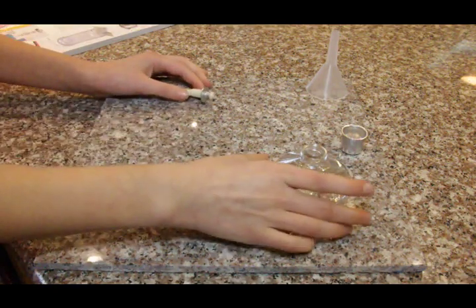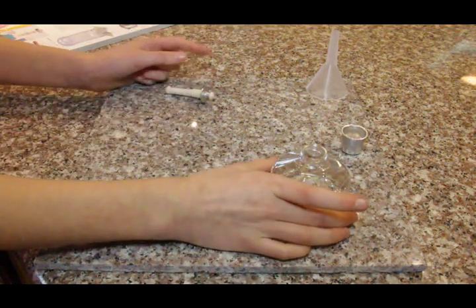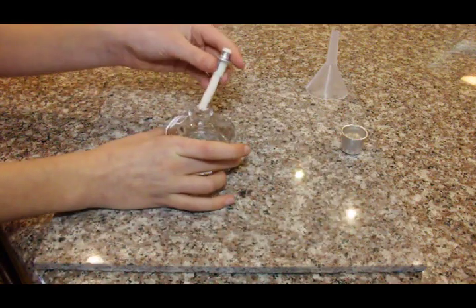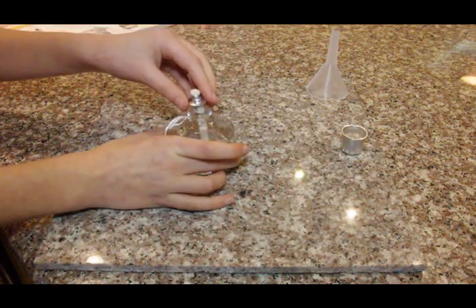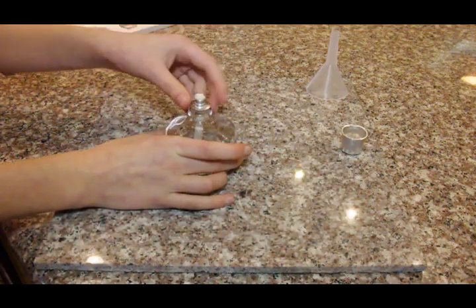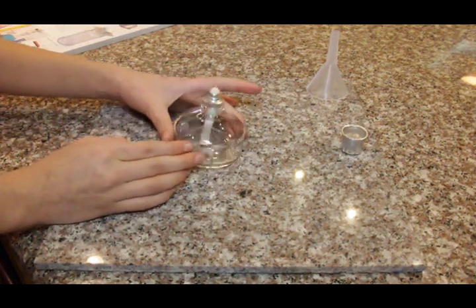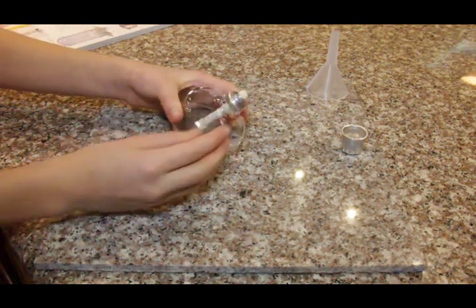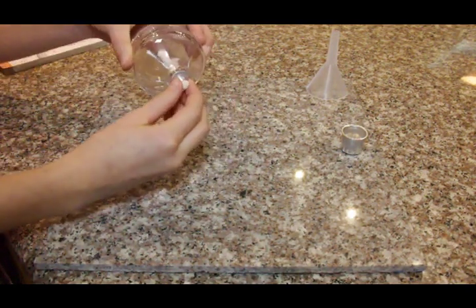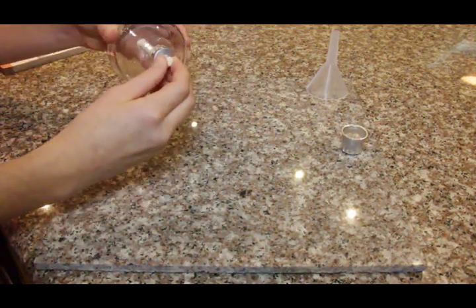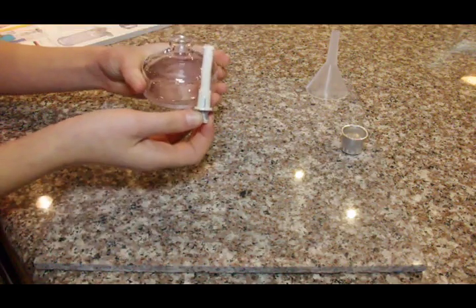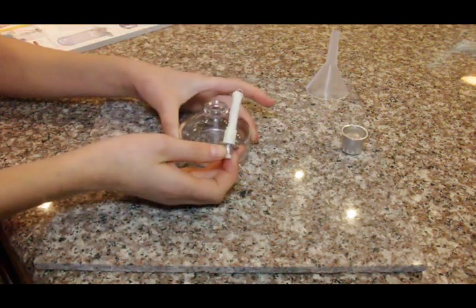Next, you take your burner base and you test this and put it in. And it should fit nicely like this. Perfect.